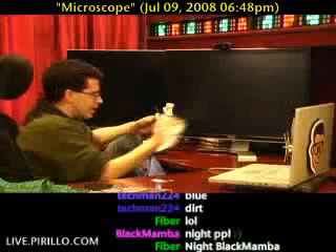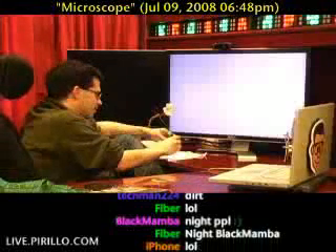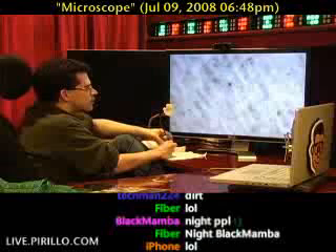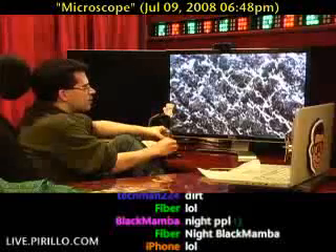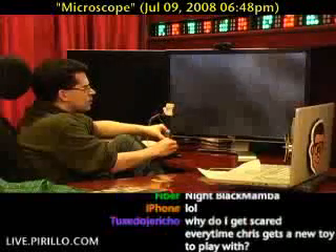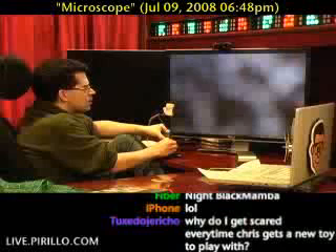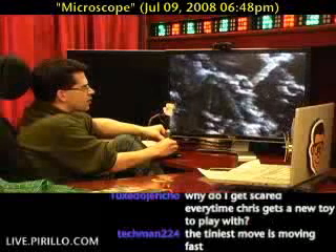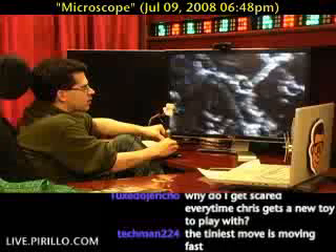Let's take a look at Kleenex. That's white — again, fibrous. Leather. Here's my wallet — this is Coach leather up close. Again, disgusting. Let's zoom in, let's get even closer. That's the super uber magnification. The stuff is smooth, but that's what leather looks like up close — kind of crackly.